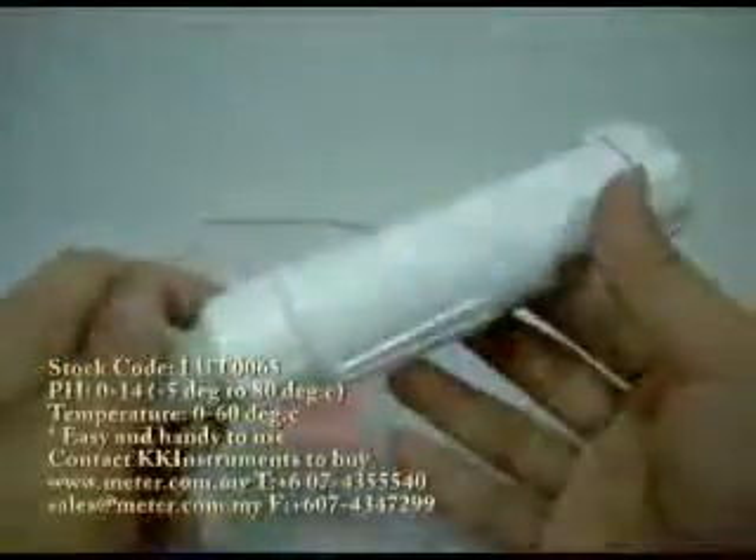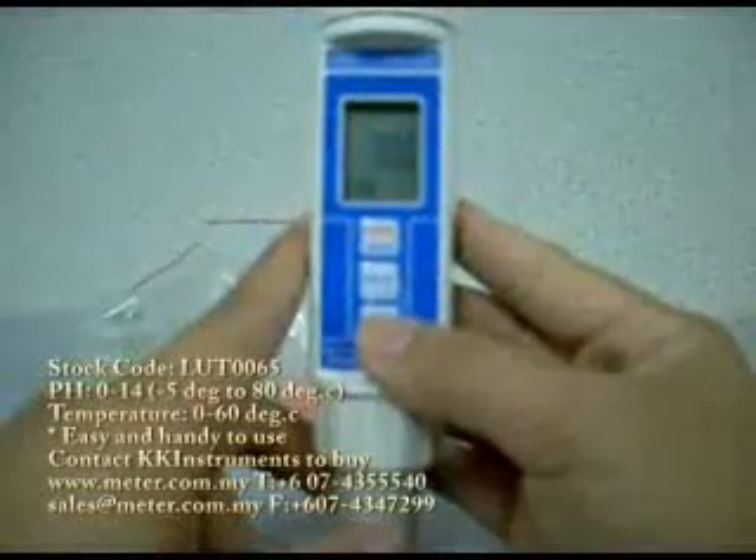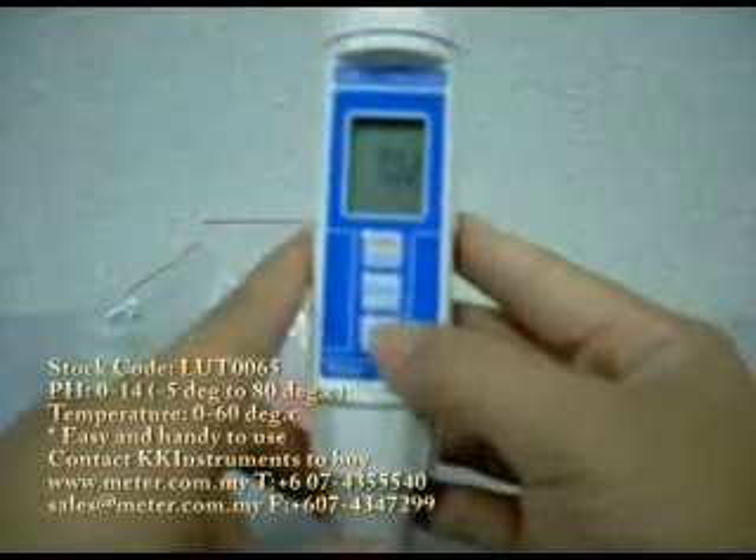This unit always comes with auto calibration. You just have to dip it into your calibration solution and press this button once more, and it will do automatic calibration.